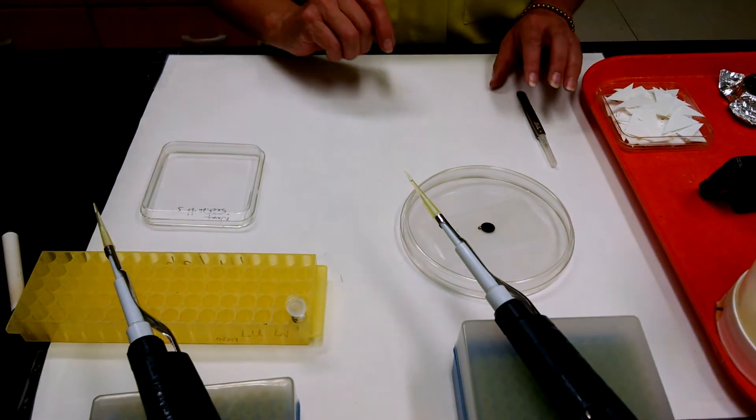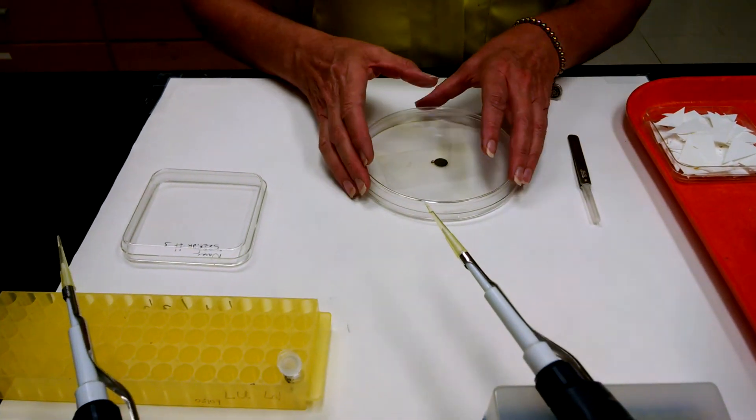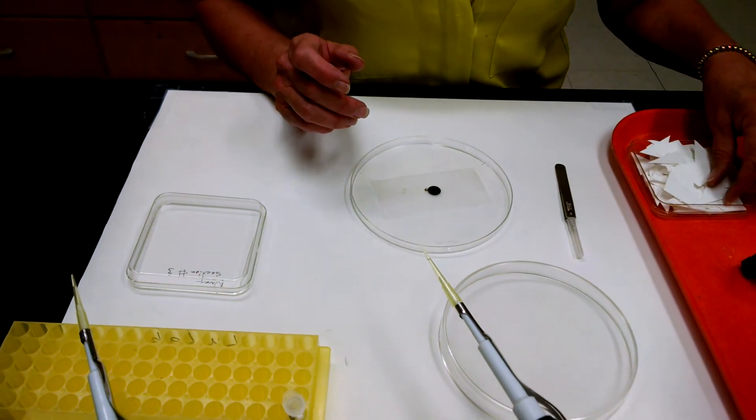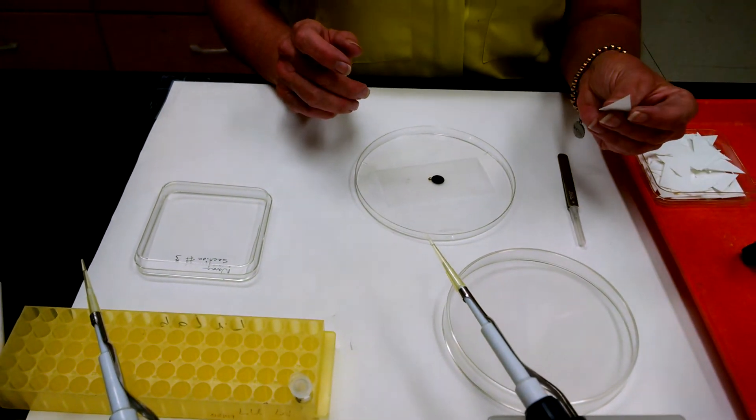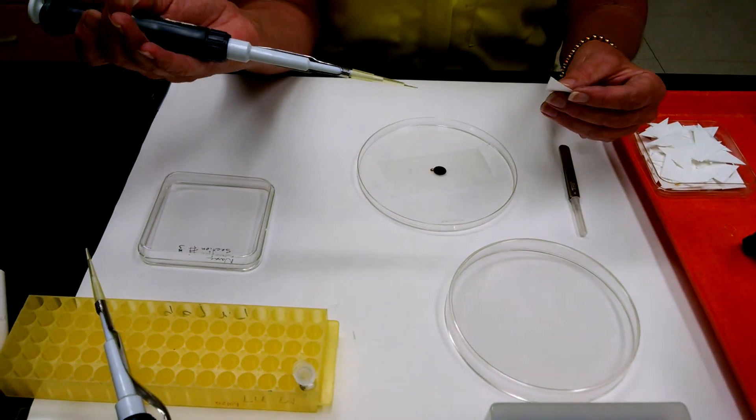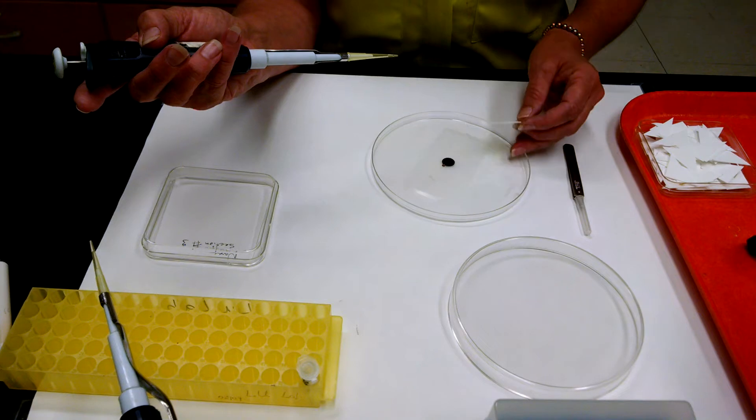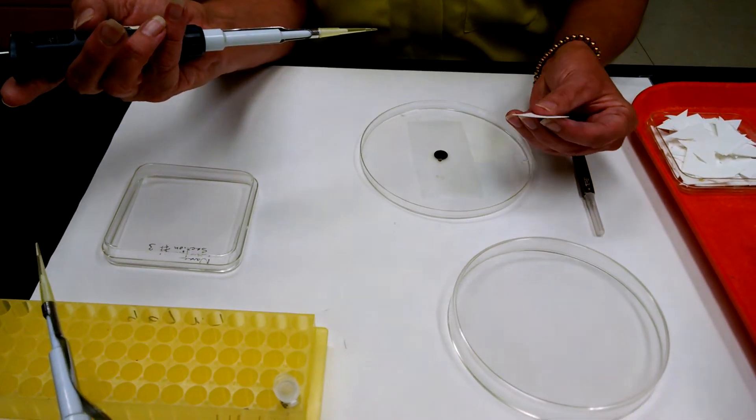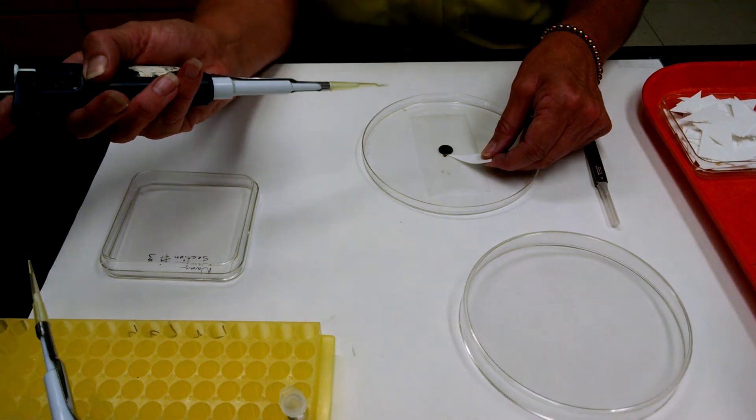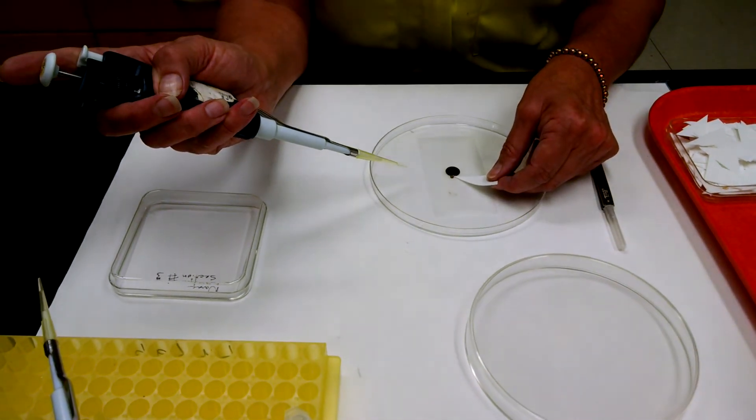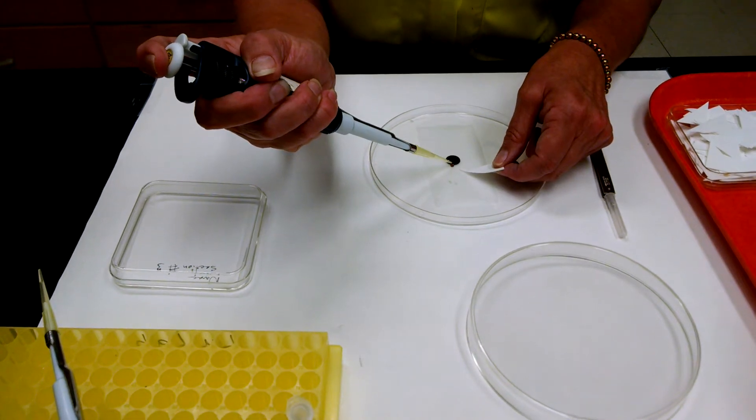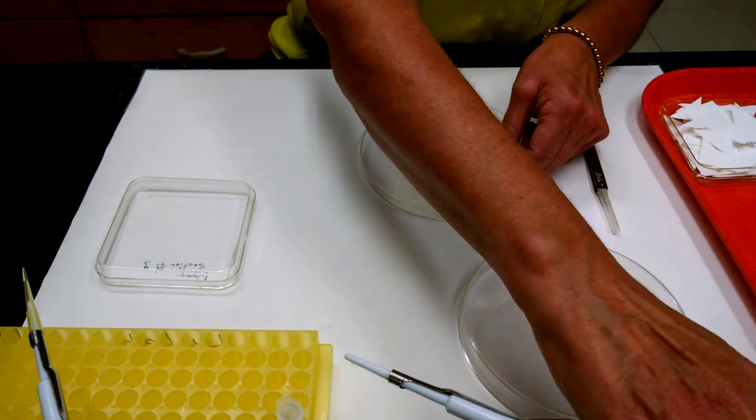So the most important thing of negative staining is not letting your grid dry out. So what I'm going to do is I'm going to get this triangle of Whatman paper and my water for the wash. And I'm going to just take the tip of the Whatman paper and touch it to the corner of my grid and the water will wick away. And I immediately add 10 microliters of the wash. Dispose of the tip.